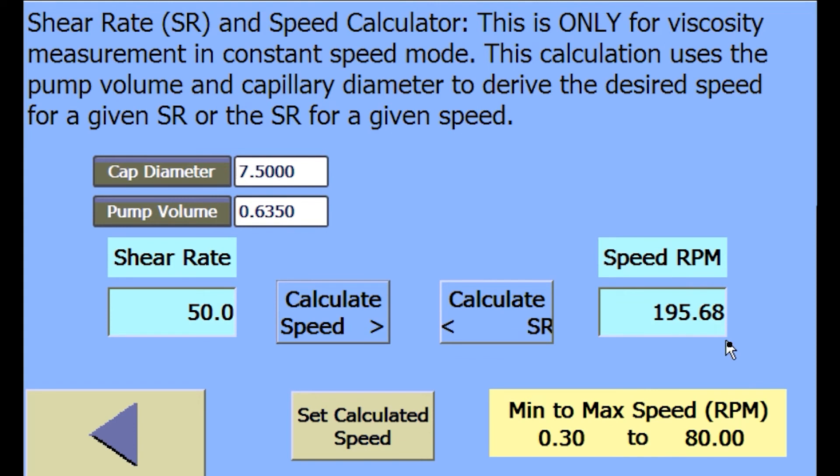Below the speed set point is the range of pump speed the instrument can be run. The speed set point, which is determined from the shear rate entered, is calculated based upon the pump volume and capillary die installed in the system.